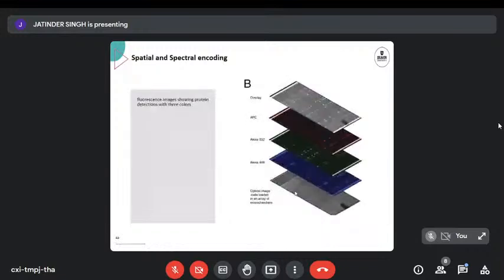This is the way that looks in detail. And this is one of the last ones. This one looks at a much more applied way. It measures the proteins that have been excreted. It also looks at the way that the cells are moving.